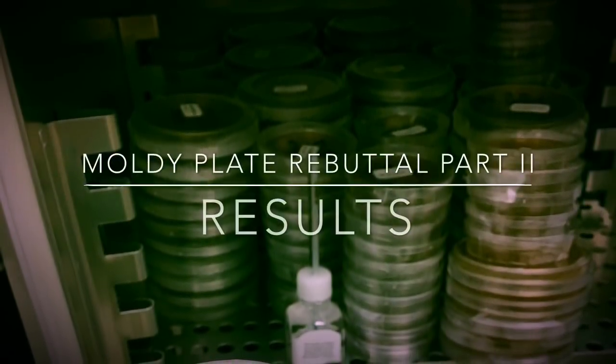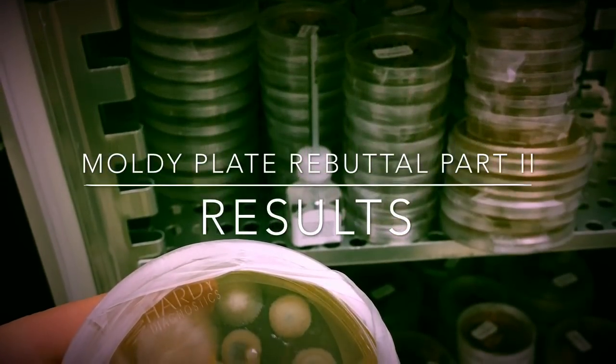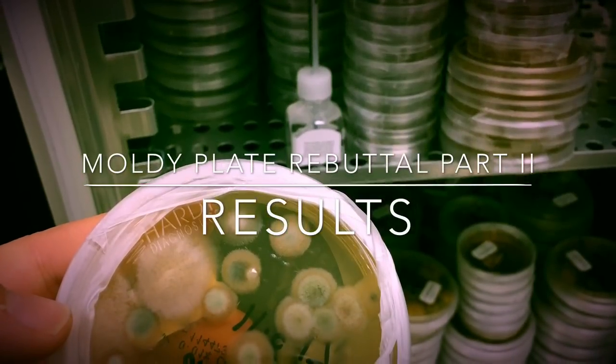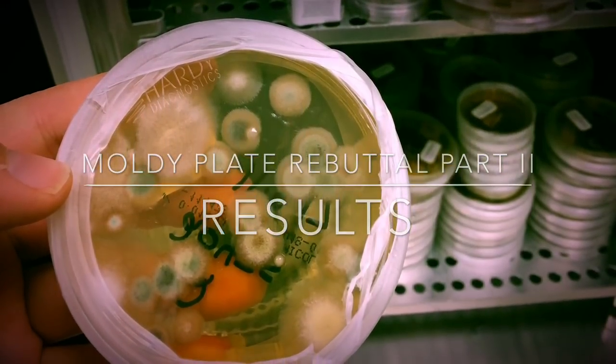Welcome back everyone to my moldy plate reality check video, part two, the results section. I was hoping to get our discussion into this video as well, but there's a lot of information in our results and I want to keep the video length reasonable. So without further ado, let's dig into what we found.